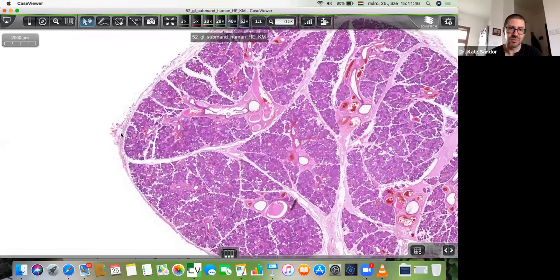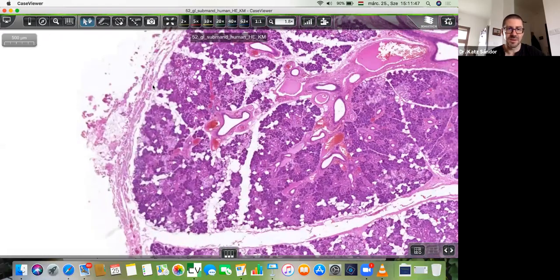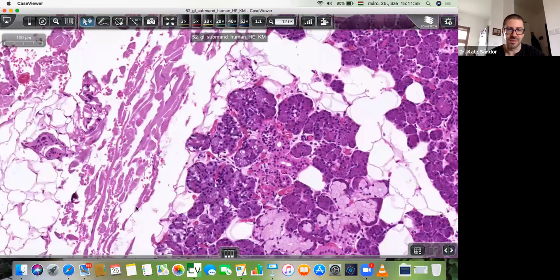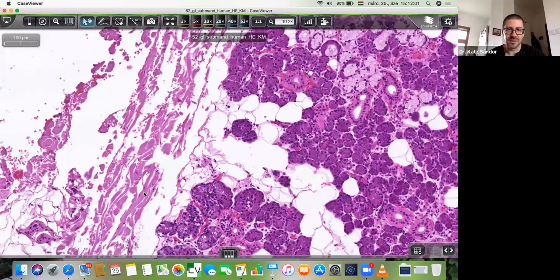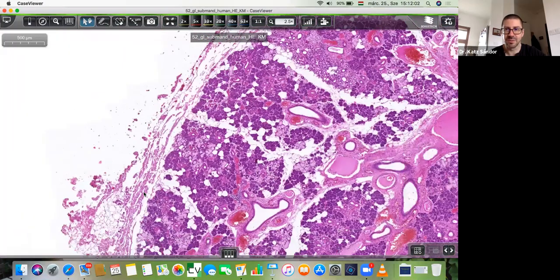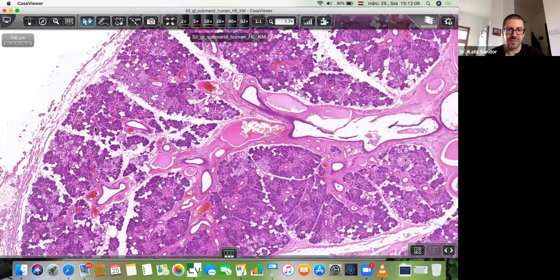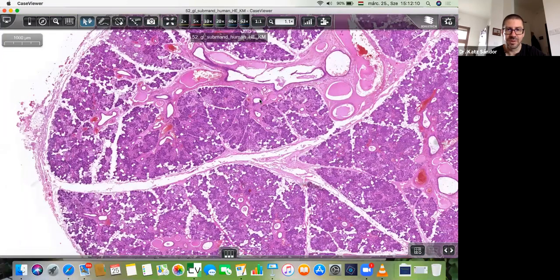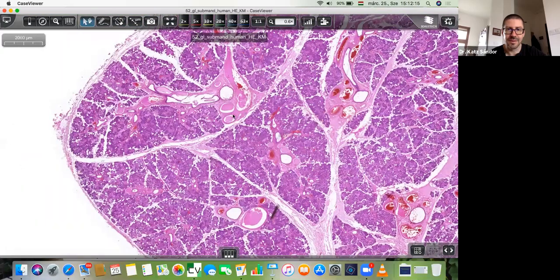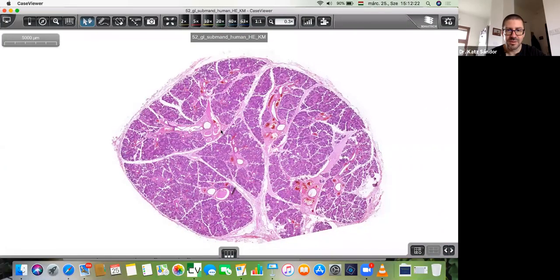When we zoom in, we can find the fibers here. So this is a capsule around the gland, with connective tissue fibers, nuclei, everything. And from the connective tissue capsule, we have septa separating the gland into lobes. Here we have a beautiful septum. This is a lobe here, there is another one, and here this. So these are the lobes.